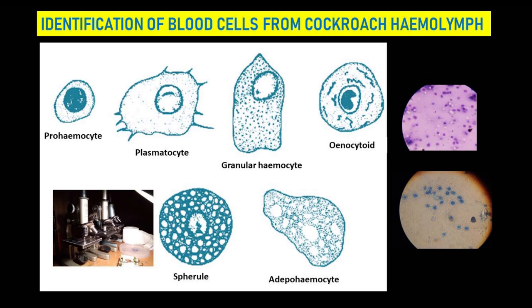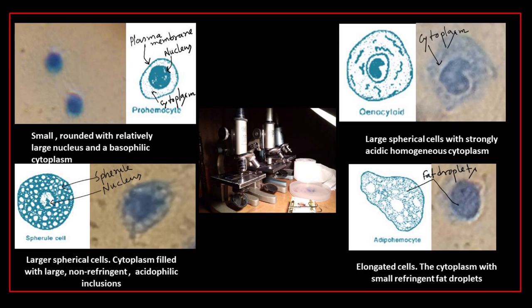Here comes the first one — prohemocytes: small, rounded, with a relatively large nucleus and a basophilic cytoplasm. Oenocytoids are large spherical cells with strongly acidic, homogeneous cytoplasm.